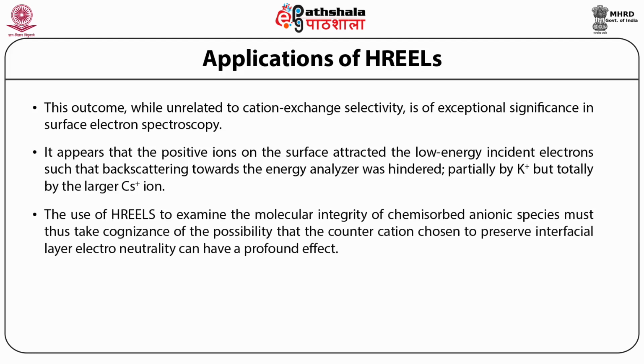The use of HREELS to examine the molecular integrity of chemisorbed anionic species must thus take cognizance of the possibility that the counter cation chosen to preserve interfacial layer electroneutrality can have a profound effect.